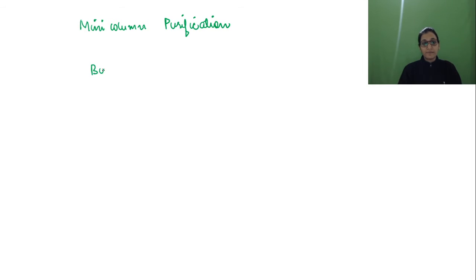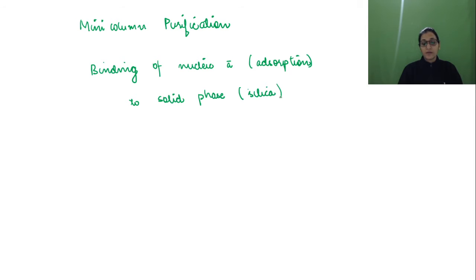So binding of nucleic acid, that is adsorption to solid phase such as silica, and will depend on pH and salt concentration of buffer. So this was mini-column purification.